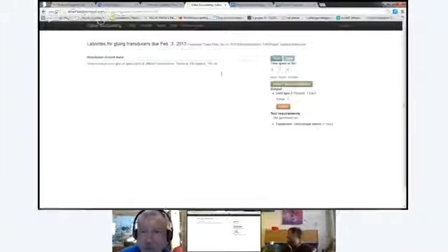This is really cool. If you look down there, you can also see that you have a planned output. You can say how many you made. You can also log that some of them failed. If I press the fail button, what happens? It says how many failed and why they failed.